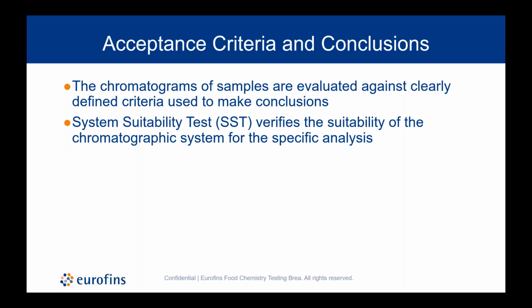The system suitability test is often a component of the compendial method, and that simply verifies the method suitability. The chromatographic system is suitable for this specific analysis. So each time you run the method, you want to confirm that you can accurately analyze your samples, and the system suitability test is what allows us to confirm the accuracy and performance of the chromatography.